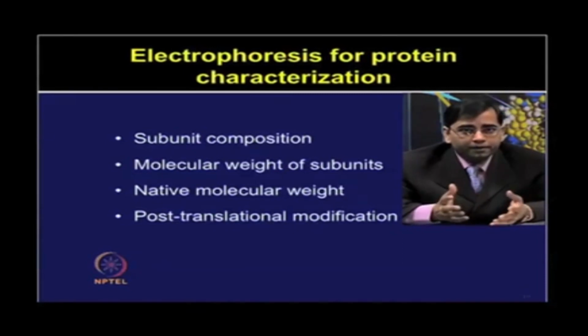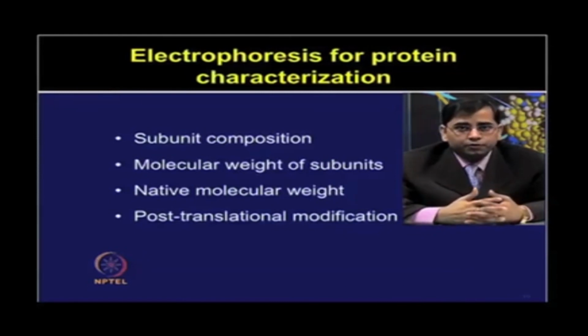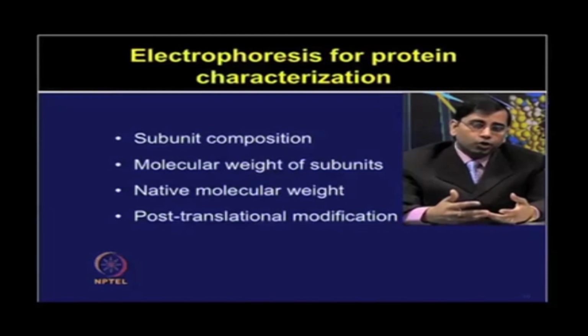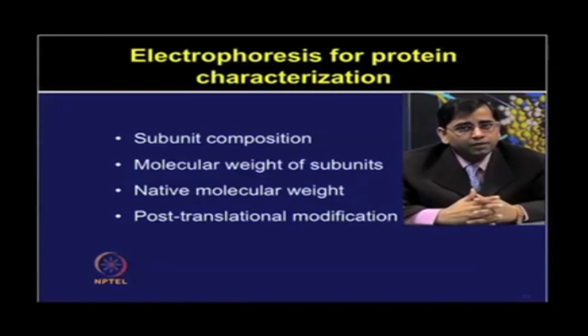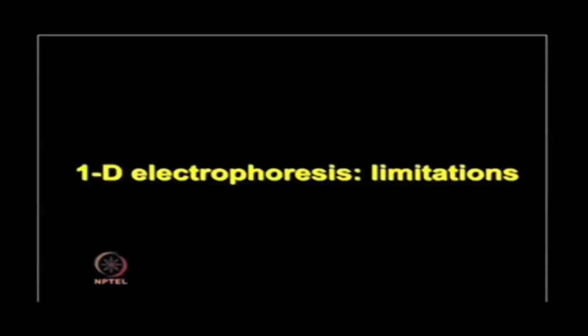If you want to compare the proteins based on their isoelectric point as well as the separation of isoforms or PTM forms based on the molecular weight, again two-dimensional electrophoresis will be useful. So one needs to know the concept and the laboratory way of using these techniques, so that by applying a combination of the techniques, one can study different types of properties.